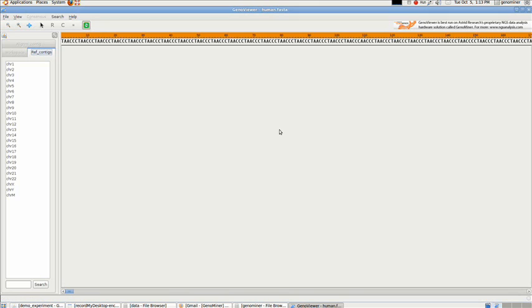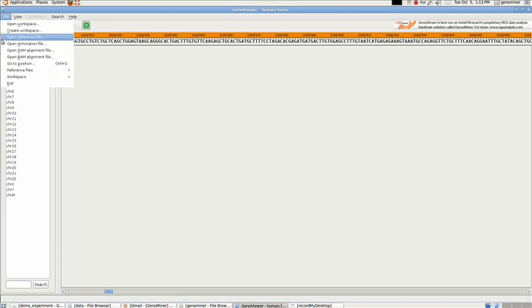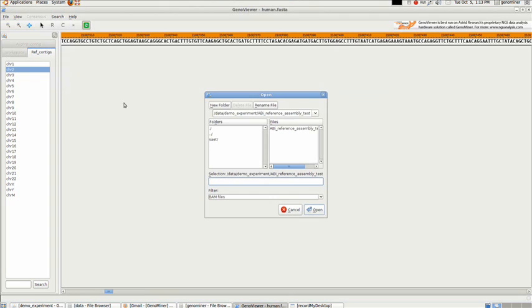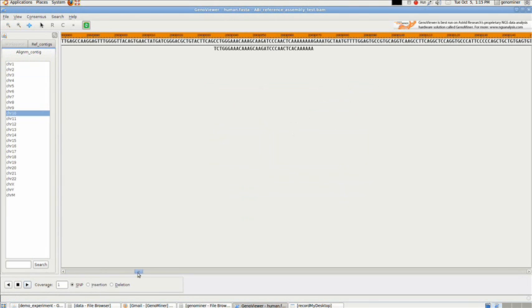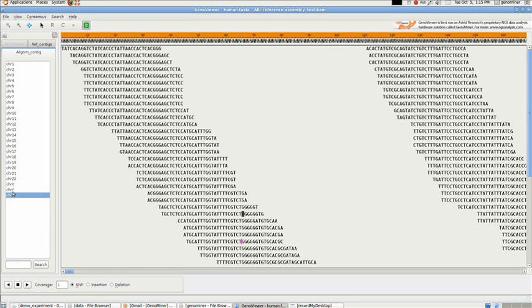Throw a glance at the chromosomes listed on the left-hand side. You can scroll each chromosome with the scroll bar. Then open the BAM file. The alignment file also contains more contigs. Always remember to change the appropriate chromosome in both the reference genome and the alignment file.